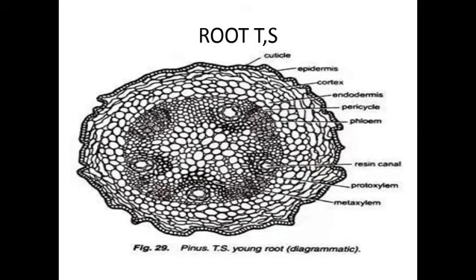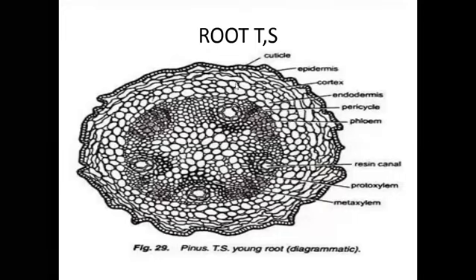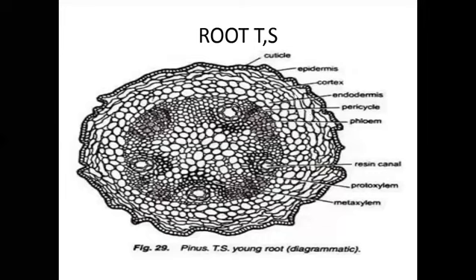Beneath the epidermis, the cortex is present. The cortex is divided into two sub-portions: one is outer cortex and second one is inner cortex. The outer cortex is made by collenchyma tissue, which is clearly visible.